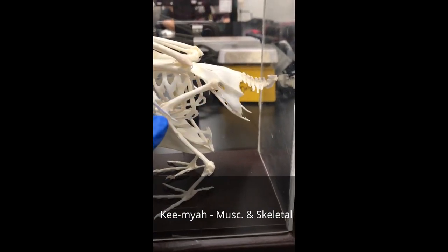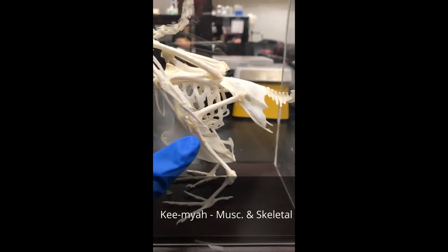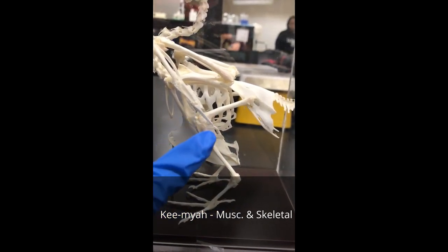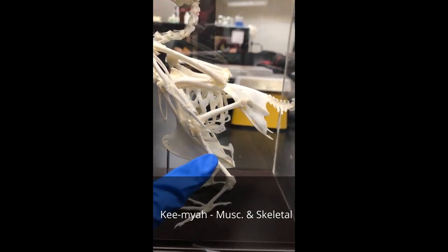Here we have the femur, and then the knee joint, and the fibula here, and towards the back or the side of it is the tibiotarsus.